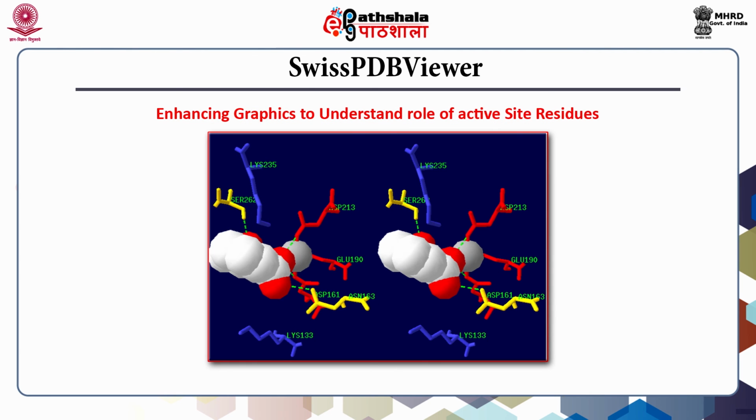Mark V in the fourth column for OSB 789. Open color menu and select command CPK. Again open color menu and select command type. This will change the colors of the side chains of the residues according to the type of the amino acids involved. That is, red for acidic, blue for basic, yellow for polar, and gray for hydrophobic.